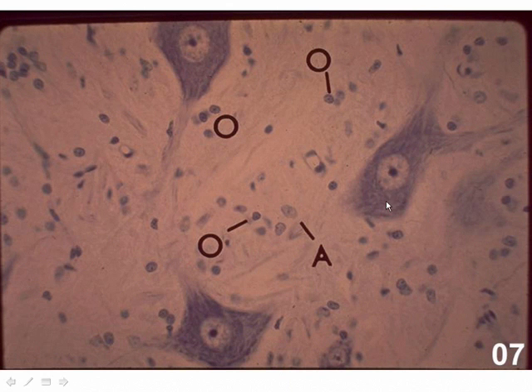Outside of the large motor neurons, you'll note that there are 2 or 3 different cell types. One has a fairly prominent nucleus. You don't really see the cell processes here, just the nucleus. It has kind of an oval nucleus. It's euchromatic.